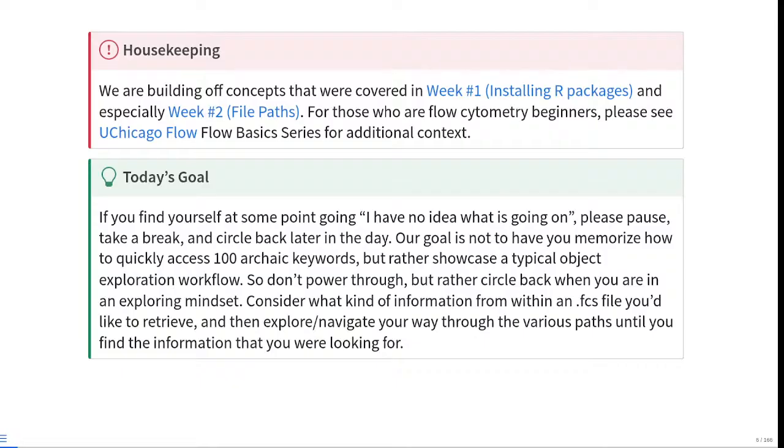Because this is the same kind of coding mindset that you'll be building slowly with time throughout the course. And this is what I'm trying to do for today, as far as an introduction in a semi-controlled manner, as far as what we are looking at together as a group.